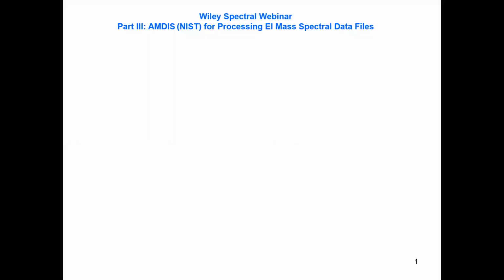Hi, this is part 3 of the Wiley Spectral Webinar Series concerning AMDIS for processing EI mass spectral data files. This is actually done on my own personal computer. I want to post on a YouTube channel, so it'd be very similar, almost identical to the one I gave for the Wiley webinar presentation, but I'll just do it locally.